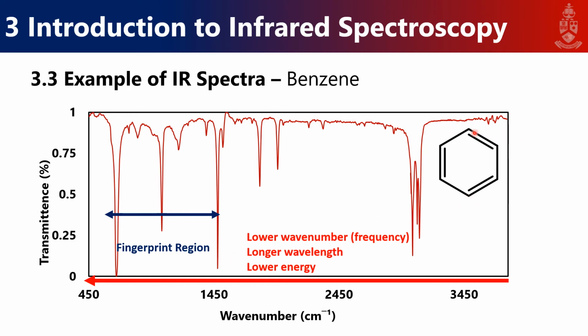So once you know what the IR of a molecule looks like, you can use that knowledge, or what those peaks are. So these are for whatever peaks these are assigned as. Then you know if you see these peaks in this order and they have these characteristic stretches, you're probably looking at benzene.